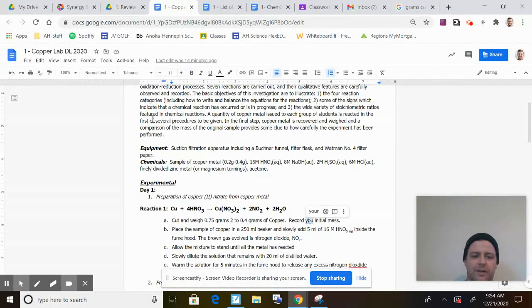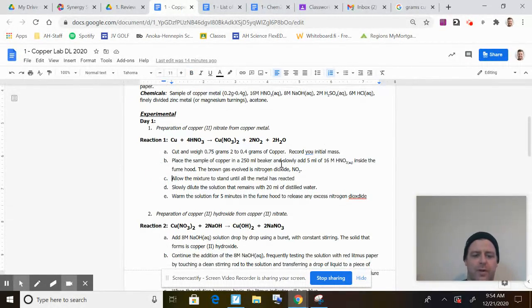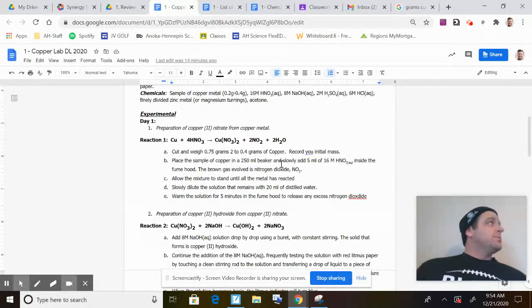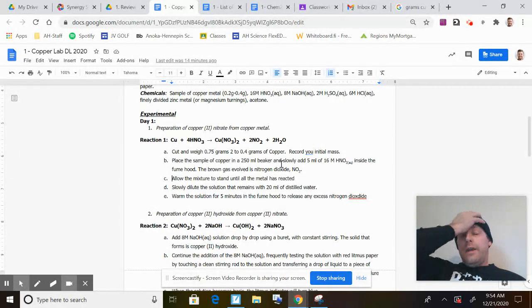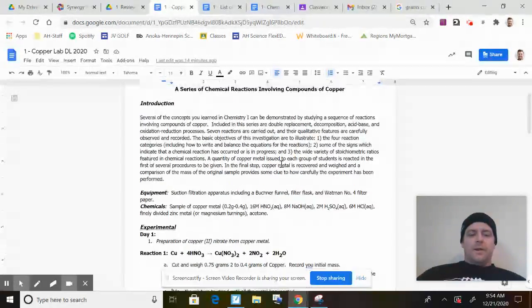The first one is a list of reactions that we're going to do. And this lab's great when we're in class because you get all these lab techniques and you'll be able to see me do a bunch of stuff. But for the most part, we're just going to use our calculation tools that we had for the review, and we'll learn a couple new things along the way.